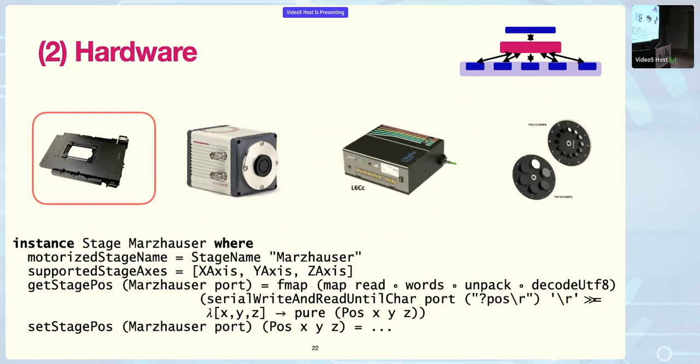What sometimes happens is we get new hardware components, we order them, and these usually come with a DLL written in C code with which you have to connect. So what we do is we write a different type class for it, and we have to be compatible with the DLL that is provided, which is not always as easy, but doable.